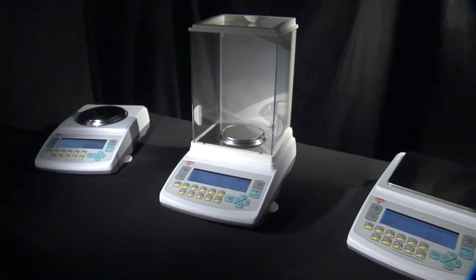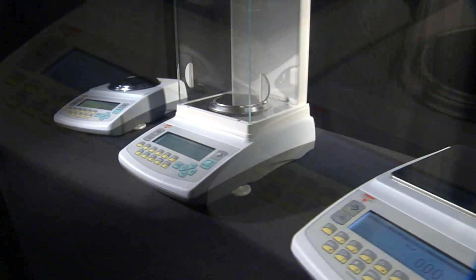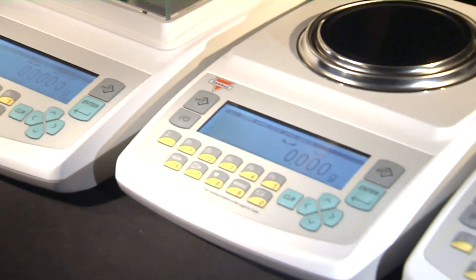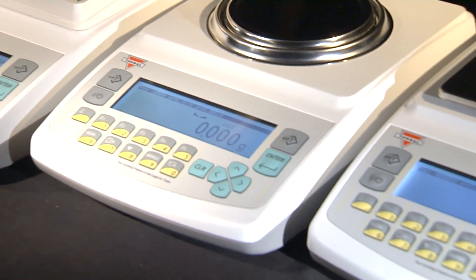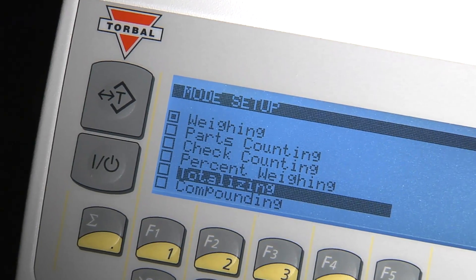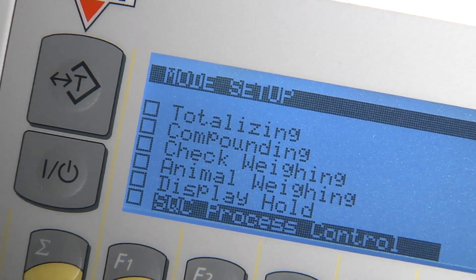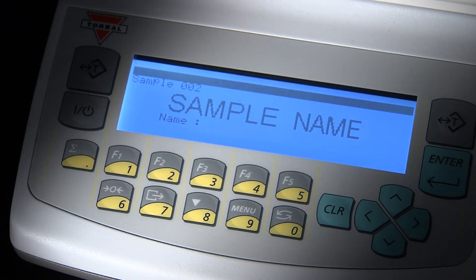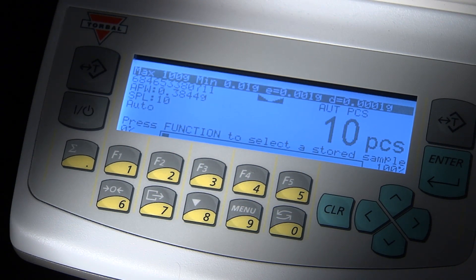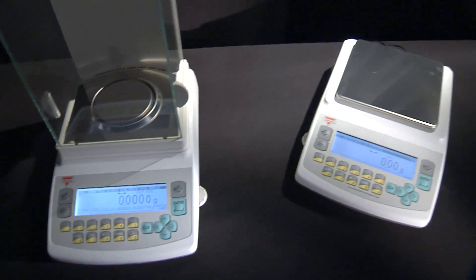Each AG unit is preloaded with more than 12 weighing functions and modes designed to enhance weighing productivity. Functions such as parts counting, check counting, check weighing, and percent weighing are equipped with database storage capability, which allows samples and reference weights to be saved and recalled through a search or barcode scanner. Each database is stored in the scale's 512 kilobyte internal memory bank.